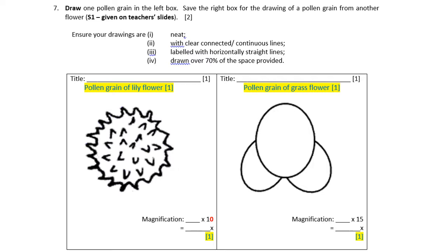All right, now so just make sure you put in the magnification. If you can, show your calculation, how you get the magnification. I don't think it is 10 times. It may be 40 or maybe up to 100 to 400 times. So, okay, this one depends on the practical, the microscope, and the degree of the magnification that you used.